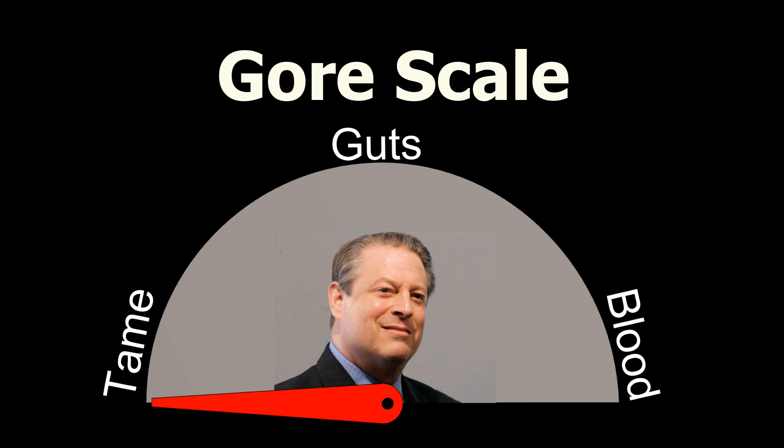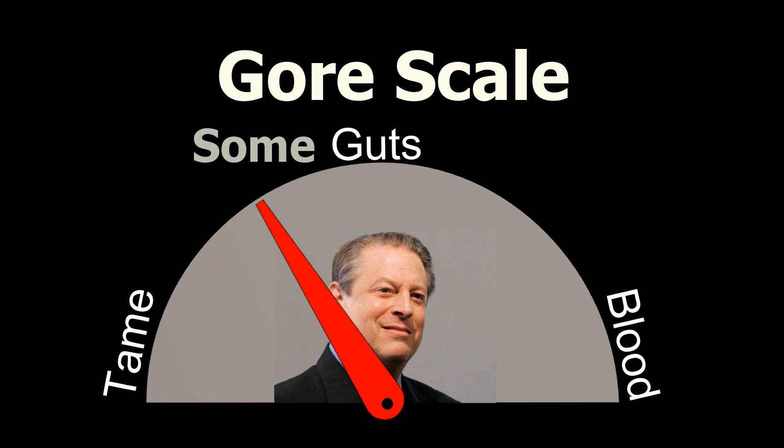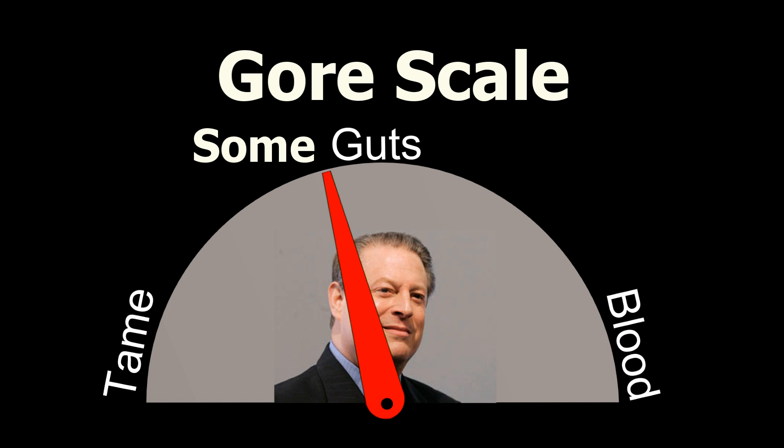Welcome to the dissecting portion of this video. On the gore scale, this video ranks some guts. If that bothers you, now would be a good time to go watch a cat video instead.